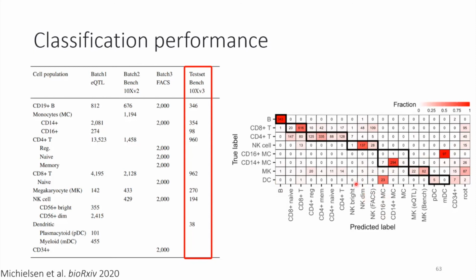Yeah, we think this is a nice way to learn if you have multiple atlases and you still don't have a very good established idea about what to expect in the data. Of course, PBMC is not the right example where you would use this because we know quite a bit about hematopoietic differentiation, but that's why we use it as well. So we can also judge a little bit how well we're doing.